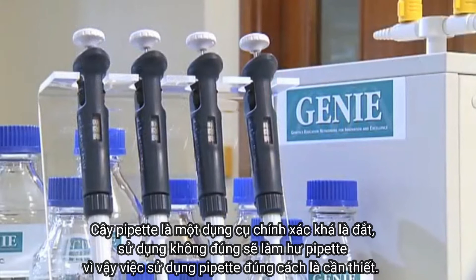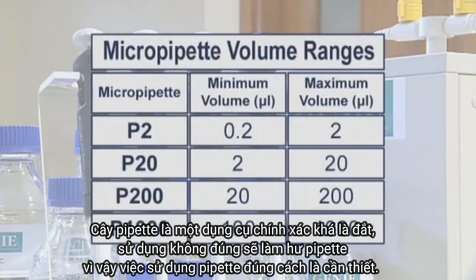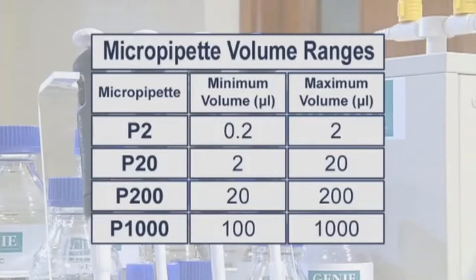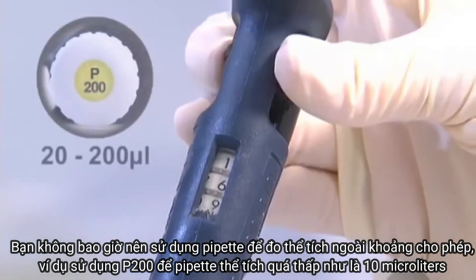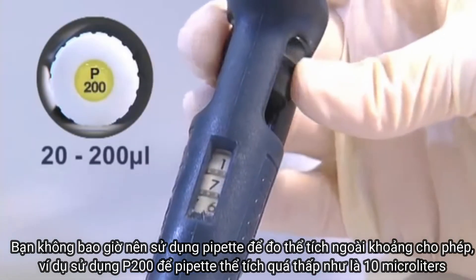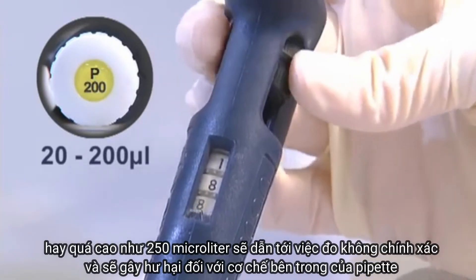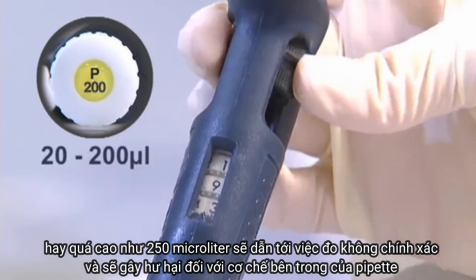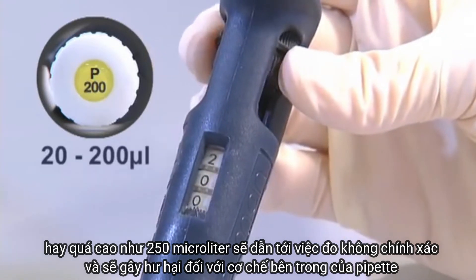A pipette is an expensive precision instrument, and improper use will damage it, so correct use is essential. You should never use a pipette to measure volumes outside of its range. For example, using a P200 to pipette too low a volume such as 10 microlitres, or too high a volume such as 250 microlitres, will result in inaccurate volume measurements and will damage the internal mechanism of the pipette.